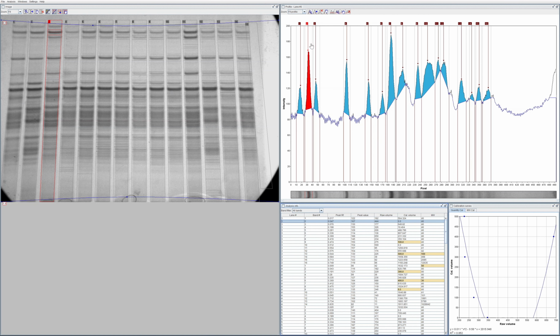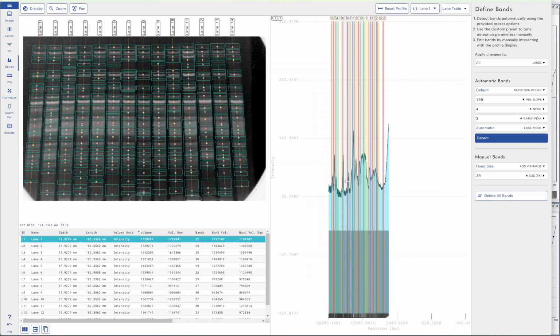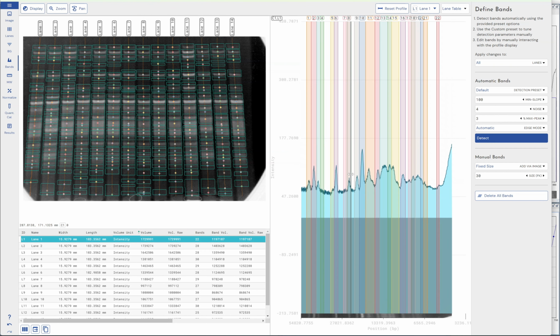Within Phoretix 1D, we do have the workflow to kind of guide users through stepwise how we think their analysis should be performed, but we have a lot of the manual tools as well to be able to allow users to get really deep into the processing of their results, what's happening at each stage, things like that. And of course, we can work within GMP and 21 CFR environments, which I'm assuming GelAnalyzer cannot. Just the different markets that we work within.